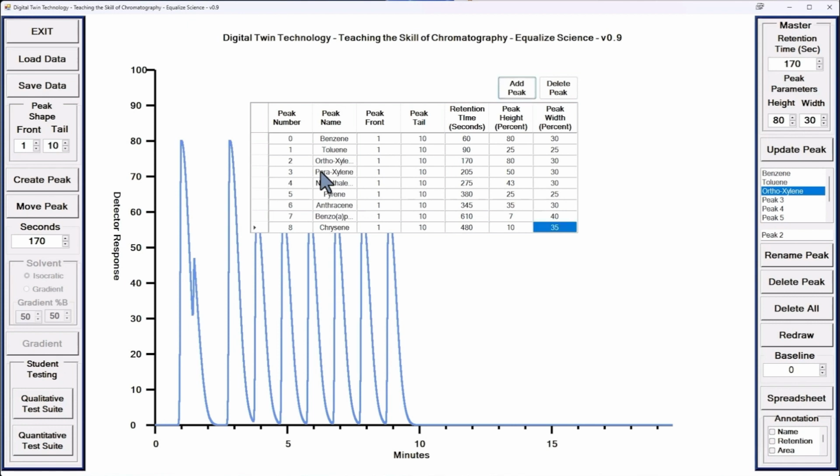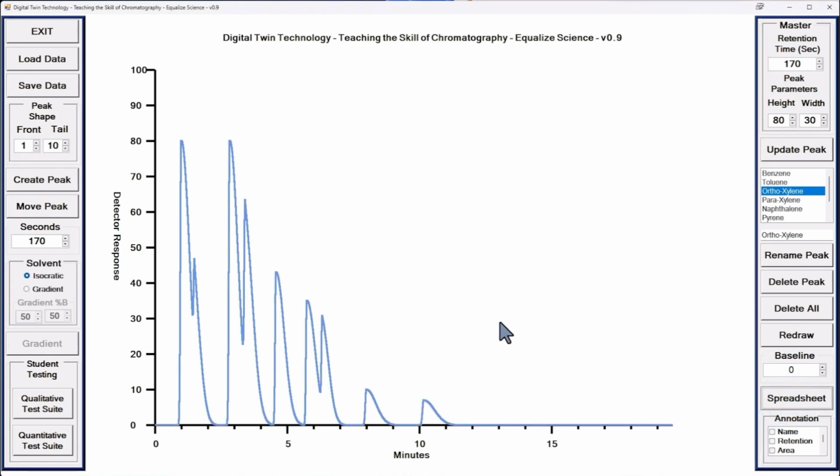Once you're done, click Spreadsheet. If there are changes, you are asked if you want to keep the changes. The chromatogram isn't quite the chromatogram we want. The tails of the peaks are too skewed. This chromatogram appears like one resulting from either an old, worn column or an HPLC with a pump problem, or maybe both. Regardless, let's go back and make some changes.